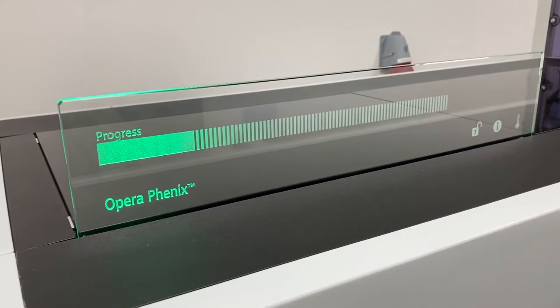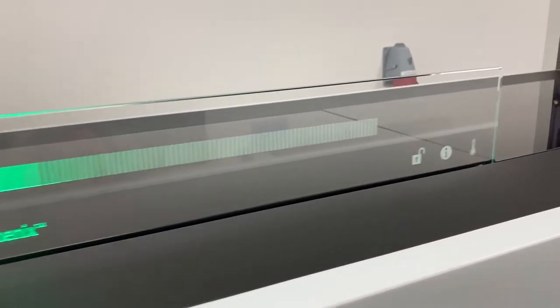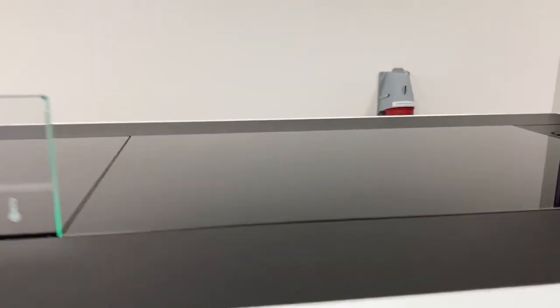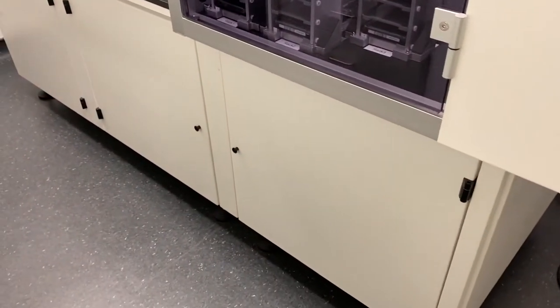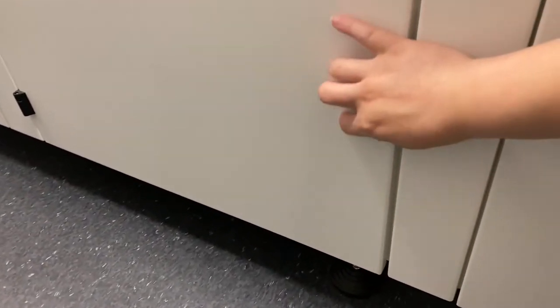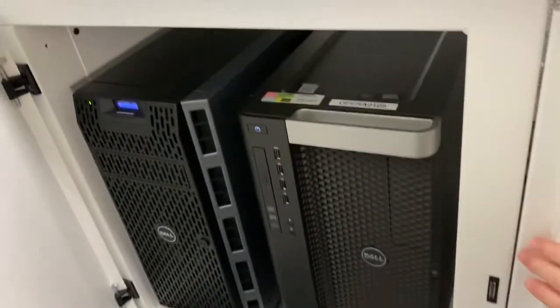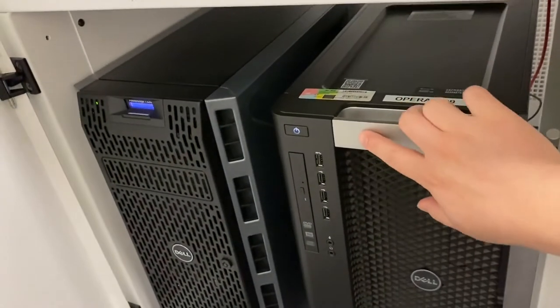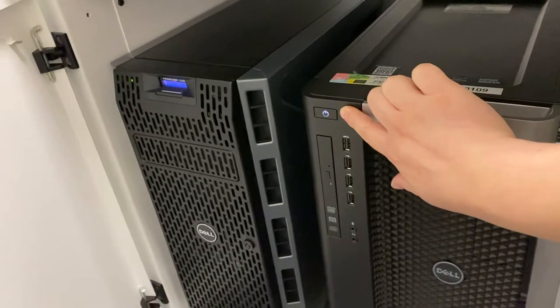This glass panel should light up in green. If you need to switch on the computer, it's in this cupboard down here, and you want to press this to switch on the computer.